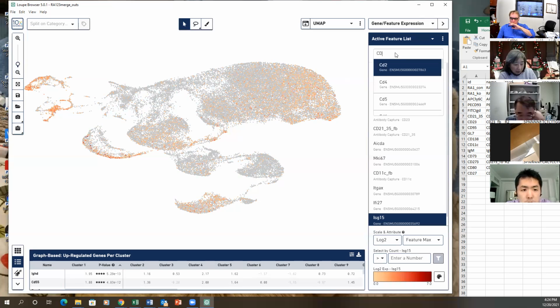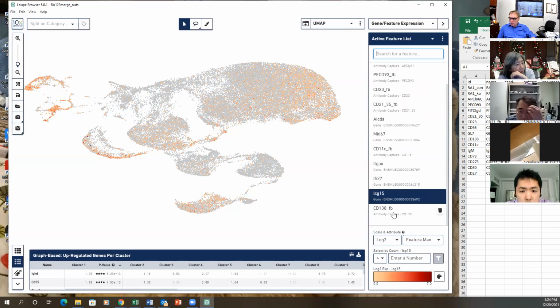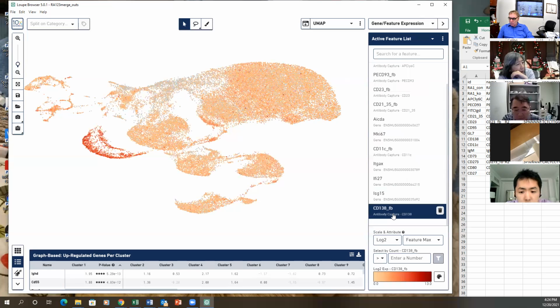Why ISG15? Well, it could be there are other ones. ISG20. Oh, so this is a plasma. That's quite good. So many plasmas. Really strange. No, the dark one, this is gene level. This is protein. Oh, this is protein. Right, so somehow the background is not completely dim. So we need to look at the real dark one.